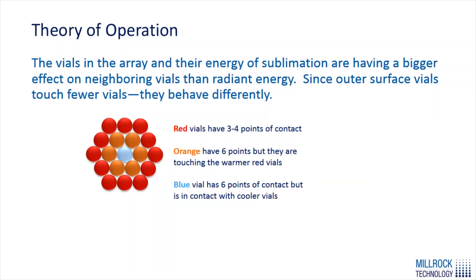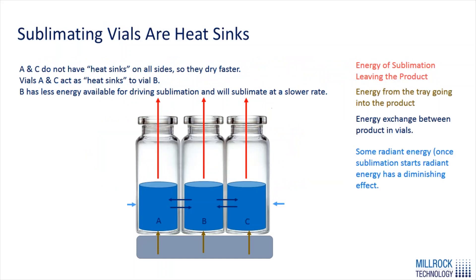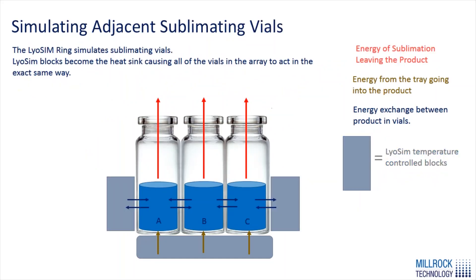The theory behind LiOSIM is based on the edge effect: vials on the outside of an array are only in contact with three or four other vials. Not just the very outside rows, but the second row and to some extent even the third row also experiences some edge effect due to radiant and convective energy. The solution is to bring in temperature-controlled LiOSIM blocks that simulate the presence of a wider array, creating uniform heat flow for edge vials as if they were center vials.